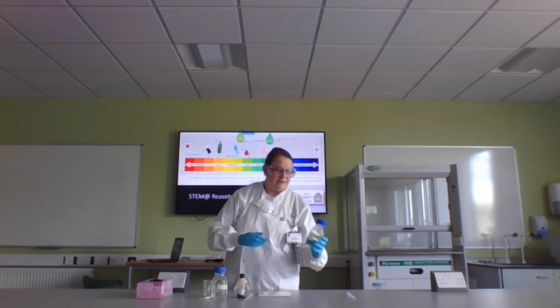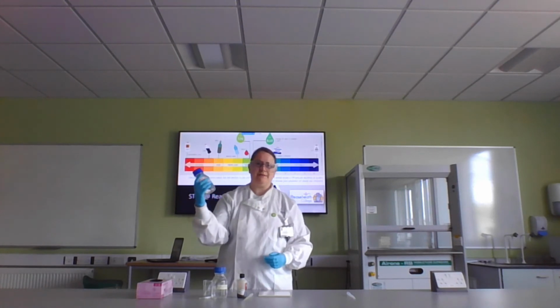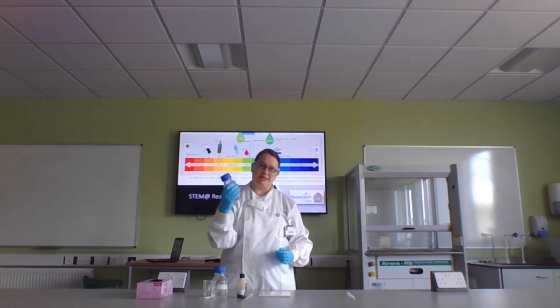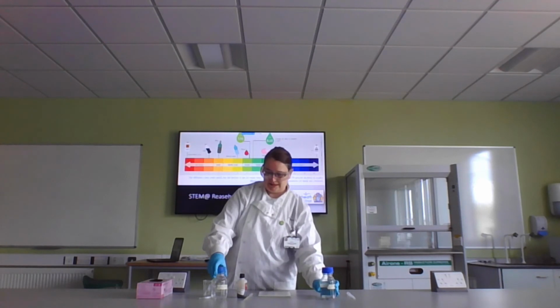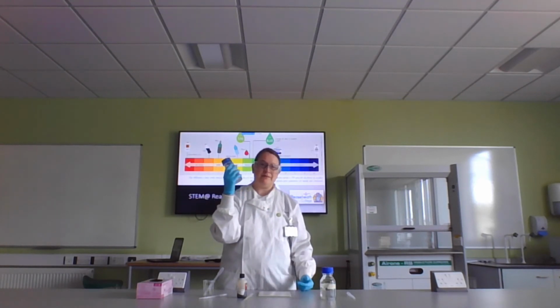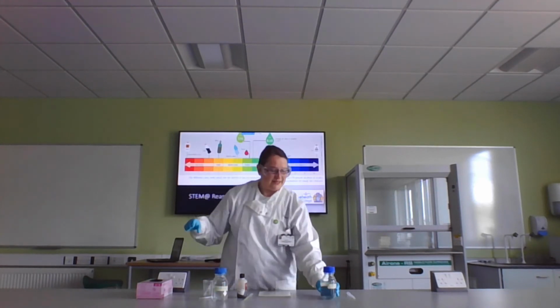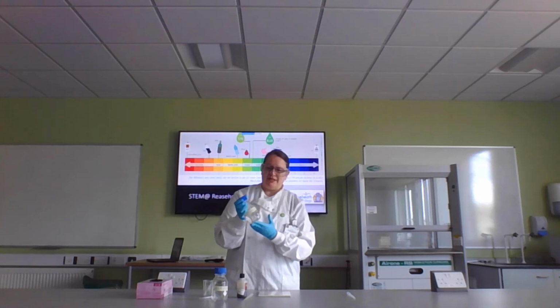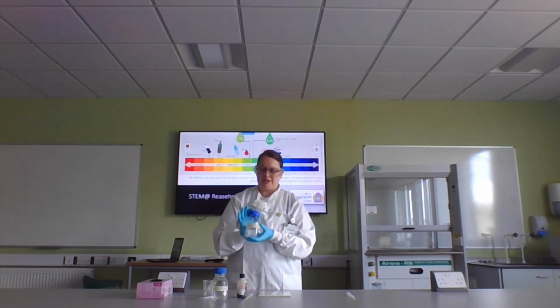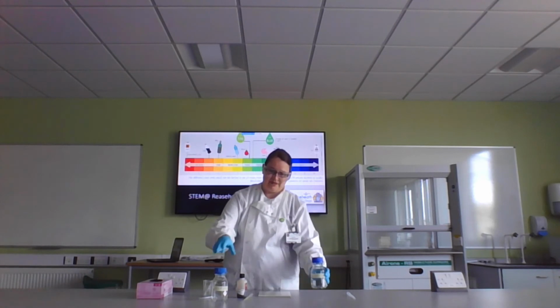So what I've got here, this is a bottle of hydrochloric acid. It's very, very acidic. This is a bottle of sodium hydroxide. It's very, very alkaline. If I got this on my skin, it would burn through my skin and I would end up in accident and emergency.